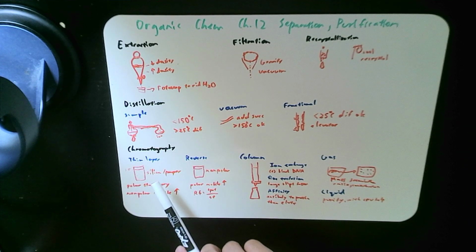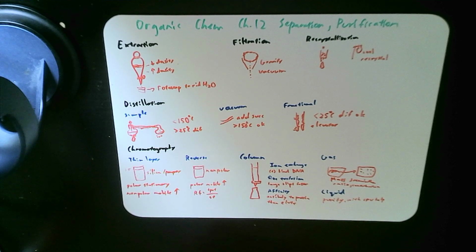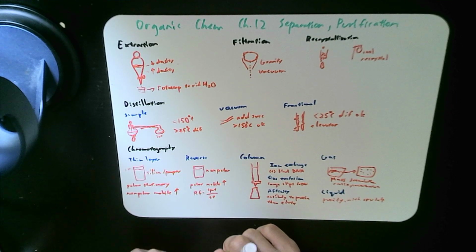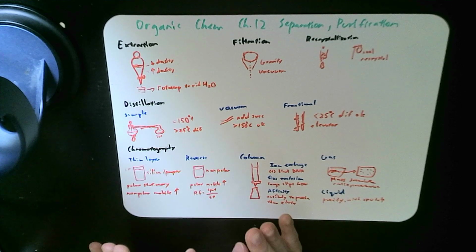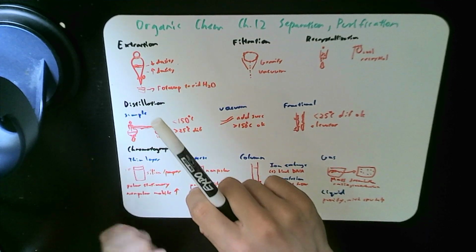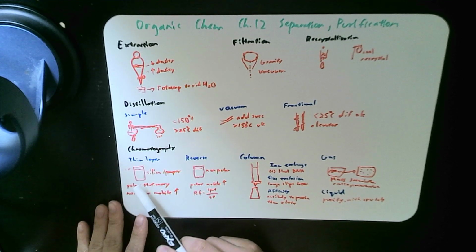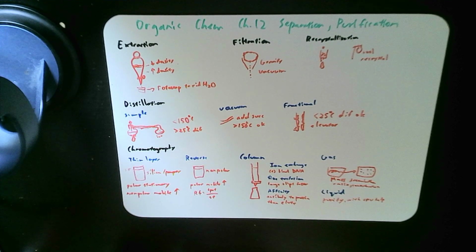Chromatography. There are ways to also separate and identify different compounds. So thin layer chromatography, the simple form, uses silica or paper, which is polar to attract polar compounds. You just dip it into the solution, and you have 3 spots, or more spots depending on how much you have.